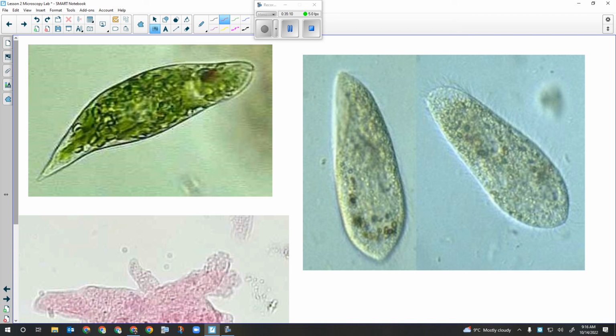Now the Euglena is kind of an interesting organism. It's mobile and photosynthetic. So it's a plant that can move. It's full of chloroplasts, the organelle that carries out photosynthesis, but it's got a long whip-like tail that it can just whip back and forth and move pretty quickly. So when it moves, it swims kind of like a sperm, if you've ever seen what those look like when they're moving. They just have a long whip-like tail, and that's how they move.